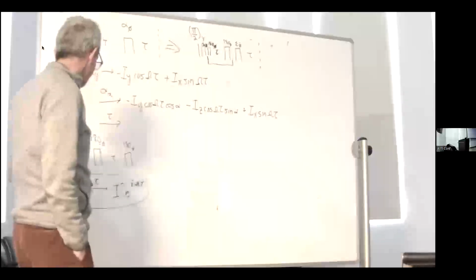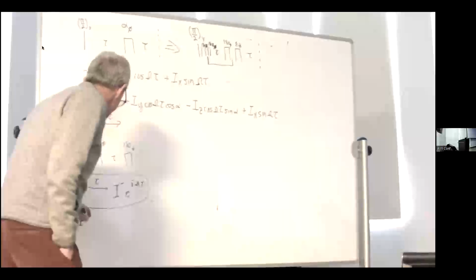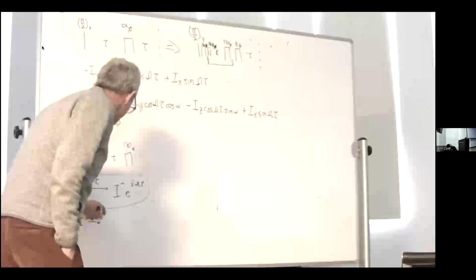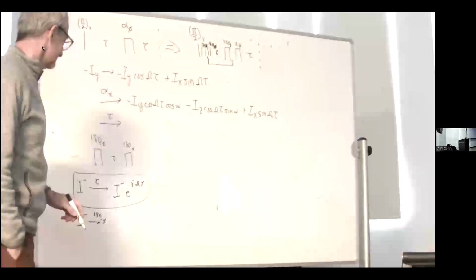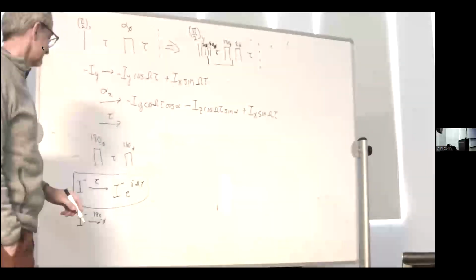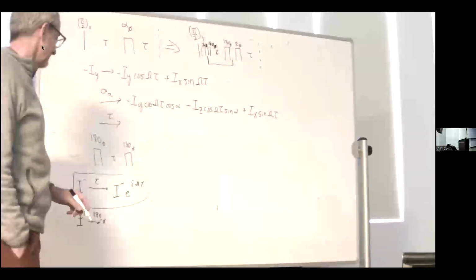So now what happens to I minus when we apply a 180 of minus phi?